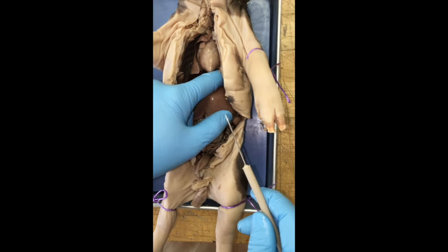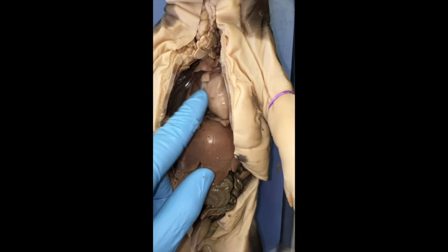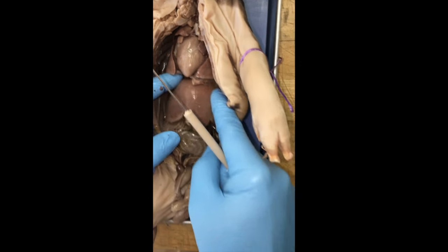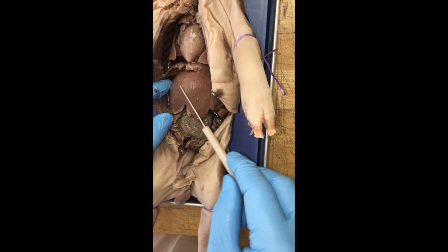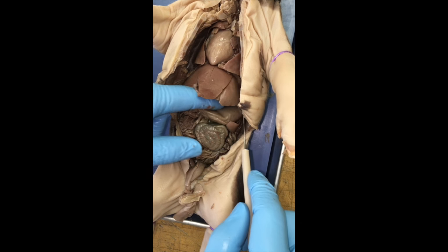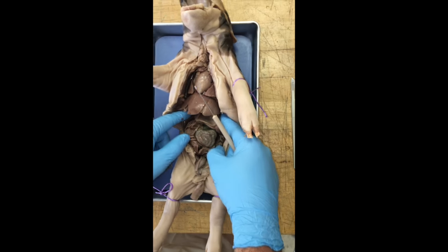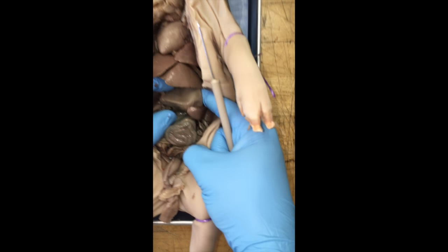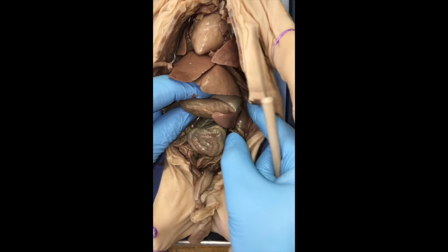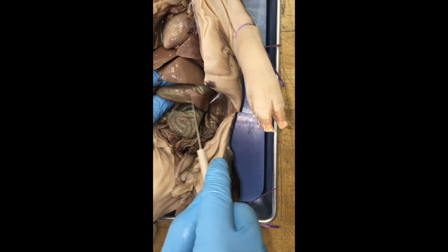Now we're going to look at the parts below the diaphragm. Above the diaphragm is your heart and lungs. Below it, the largest structure is the liver — one of your questions is what the function of the liver is. Below that you can see this little bubble, which is the stomach. The part that looks like a little finger laying on top of the stomach is your spleen.